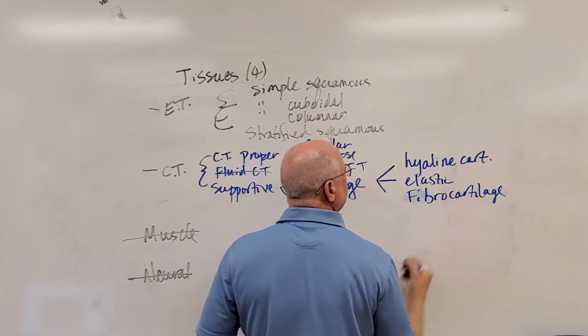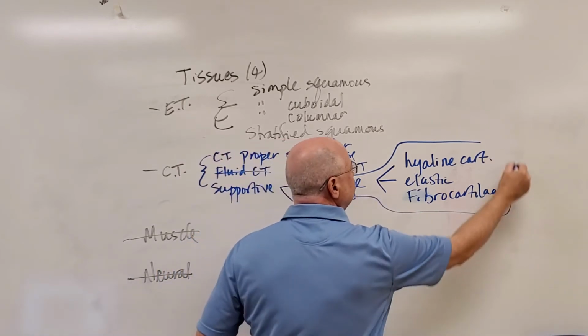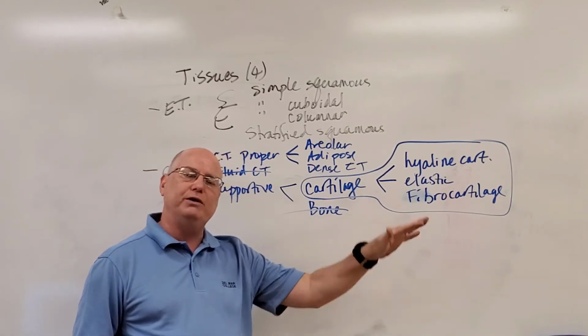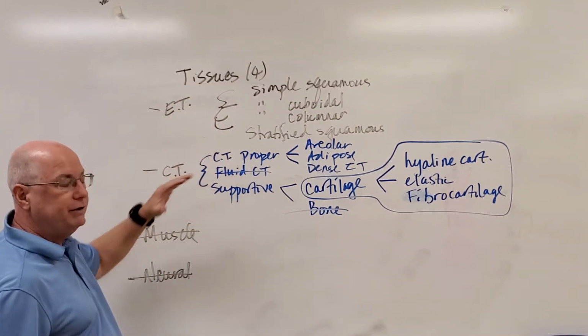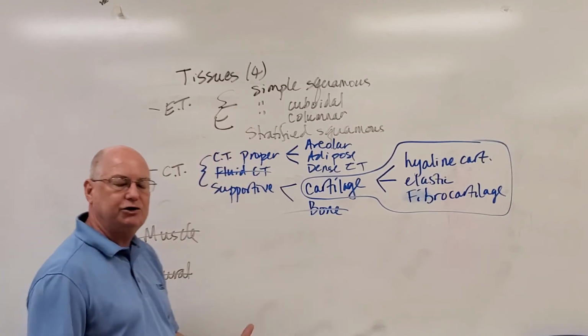Okay. So this is what we're going to focus on right now. We're going to do bone later on. Some instructors are doing it on this lab test. I am not. We're going to do bones when we do bone slides, when we do the bone tissue. So this is everything you need to know for the tissue part of our lab test. We're going to go into a lot more stuff for lecture test 2.